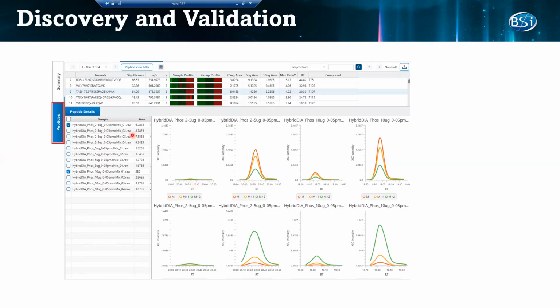And also we can check these 2 samples here. You can see we used MS2 to do the quantification. This one is the heavy peptide, the internal standard. So they are very high, and their intensity is close, and we will do the normalization based on this heavy peptide to get the final result of the endogenous peptides here. Okay, so this is the hybrid DIA, the PRM part.